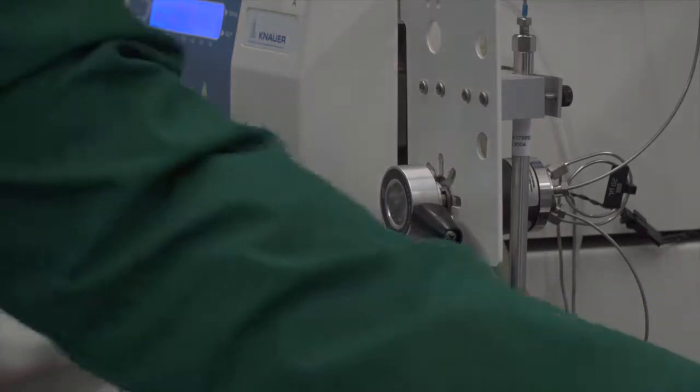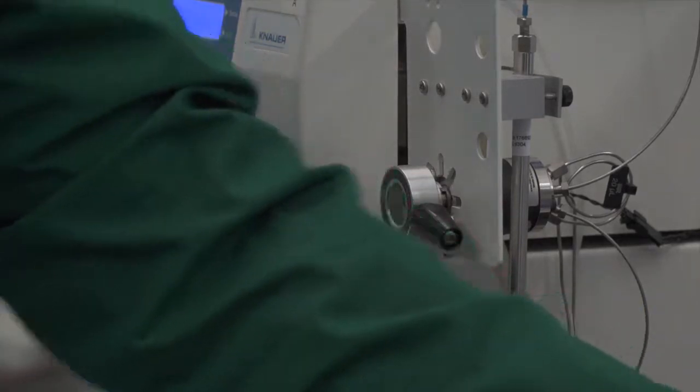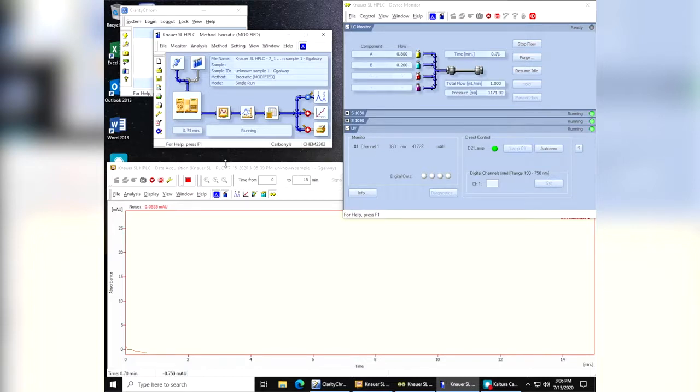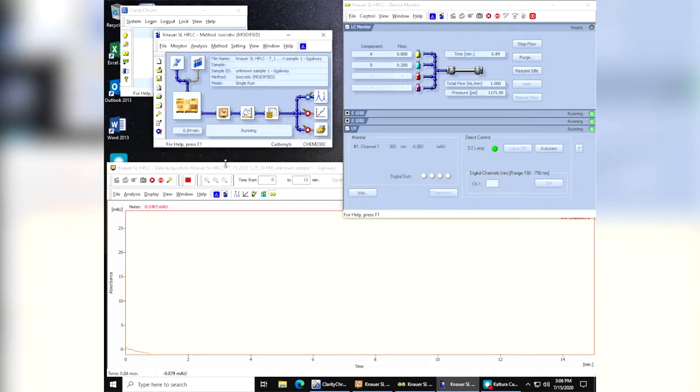Now, this sample will run through the instrument under these particular conditions. It should only take about three or four minutes, four to five minutes, maybe six minutes at the most, and we'll get the data set out.